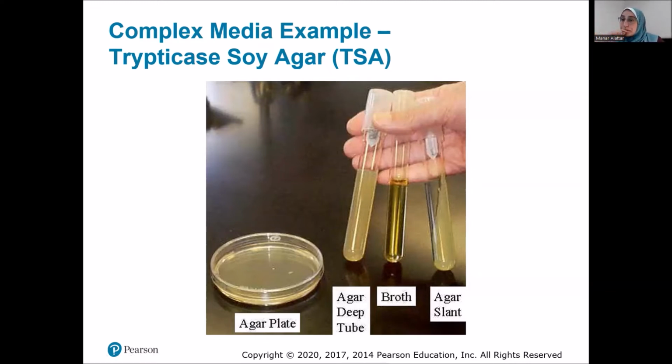discussion that we had in the first part of this lecture, how is a microorganism utilizing oxygen in its environment? You would actually just inoculate deep down into the deep with a needle all the way to the bottom, and wherever the growth is indicates to you whether it is aerobic or anaerobic. There's other methods as well for this, which we'll talk about.